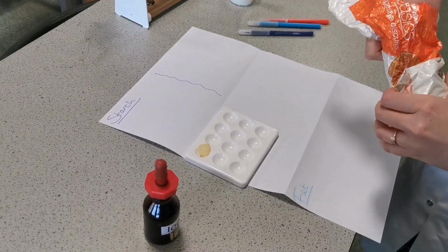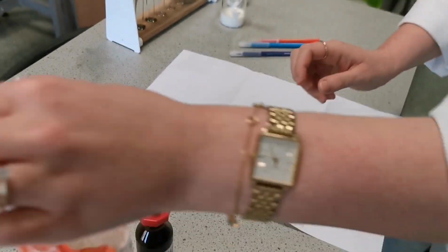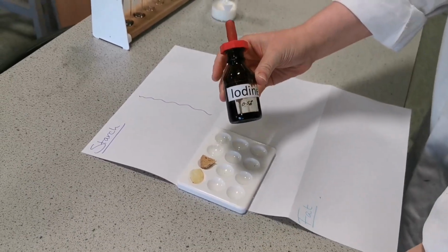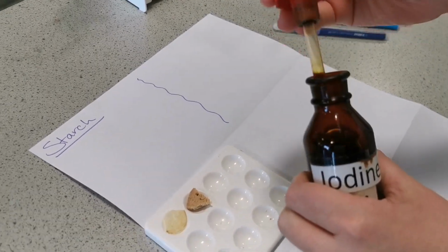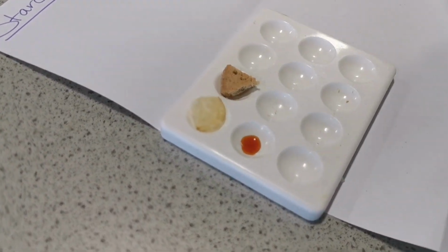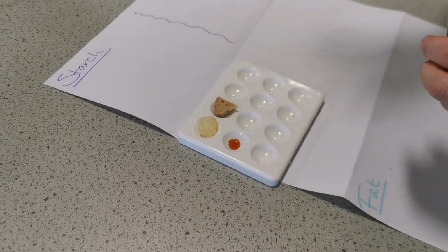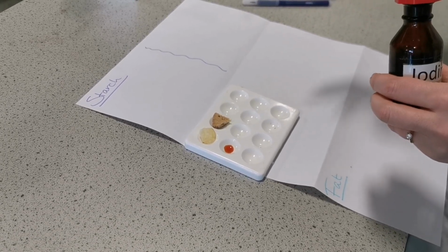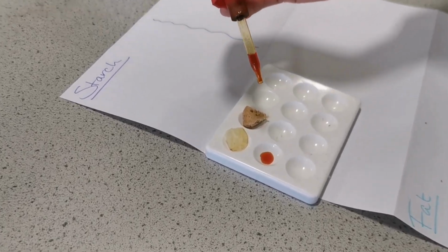And we'll get a biscuit as well. Have a little look at that, a digestive biscuit. The test for starch is nice and simple. You use this chemical that is called iodine. Now, if I take the iodine out, you can see just on its own that it is quite browny colour, like a yellowy browny colour. The positive result, if there is starch in these foods, is that yellowy browny colour should turn like a deep blue black. So all we have to do is do a little spot of iodine on these foods.